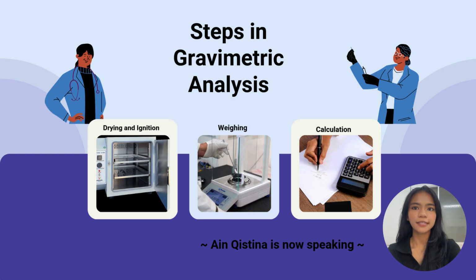Weighing is a process that measures the mass of the dried or ignited precipitate accurately. The dried or ignited precipitate is cooled in a desiccator to prevent moisture absorption and then weighed using an analytical balance. Accurate weighing is critical as the mass of the precipitate is directly related to the quantity of the analyte.